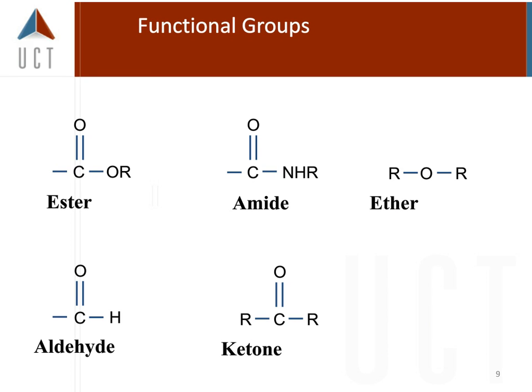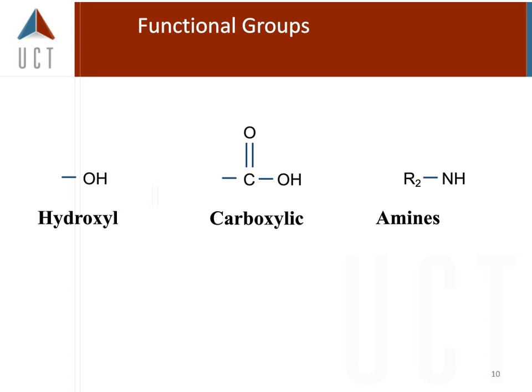Functional groups are something that we look at sometimes when I'm asked to understand a new molecule. Look at the molecular structure. See where there's electron density. Where will there be charge? Is there a carboxylic acid function? Is it an amide function? When I'm picking out my phase for my extraction, which phase am I going to use? Why will I use an ion exchanger? Or why will I use reverse phase? Or why will I use both of these, use a mixed mode? So understanding something as simple as the structures and the functional groups.